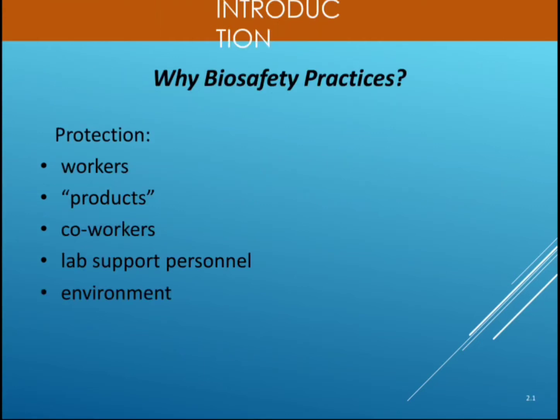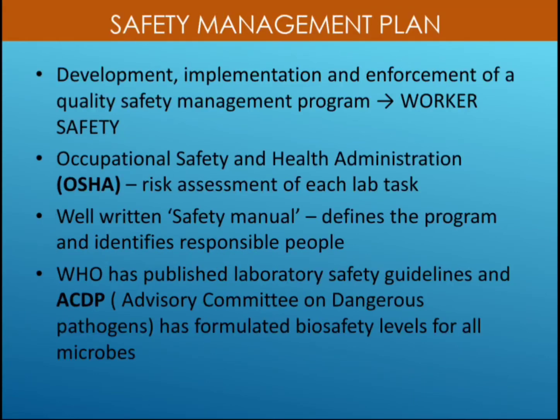Next, in the introduction we will see why biosafety practices are to be implemented: protection of the workers, protection of the product, co-workers, lab support personnel and the environment. Next, safety management plan. What safety management plan has to be implemented?